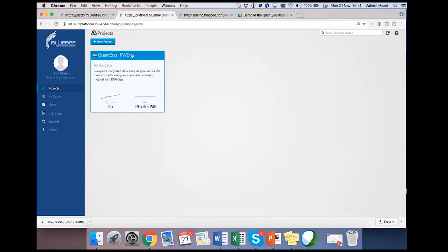Okay. Is there an official minimal number of reads supported for the analysis? We had it once in our application note, and I think 5 million is great, but you can go down to 1 million, and you can still have a good result in your differential gene expression analysis.